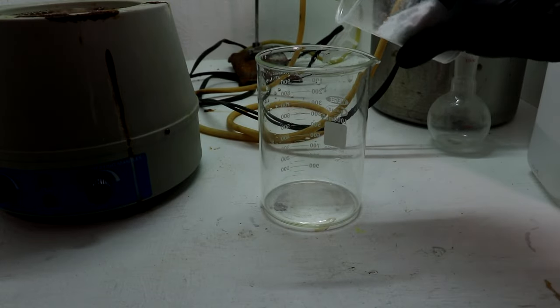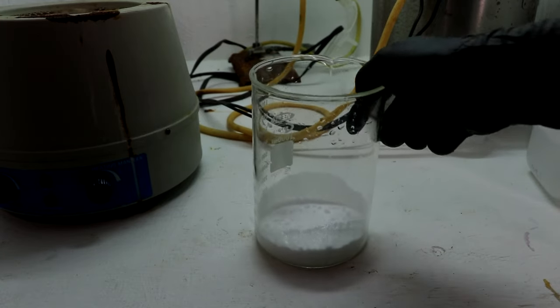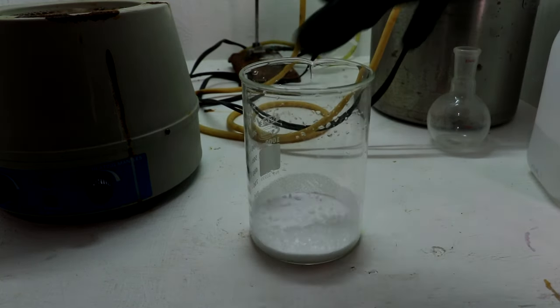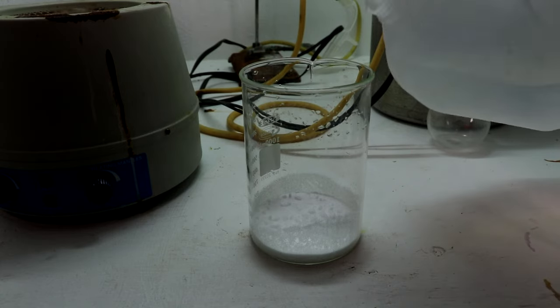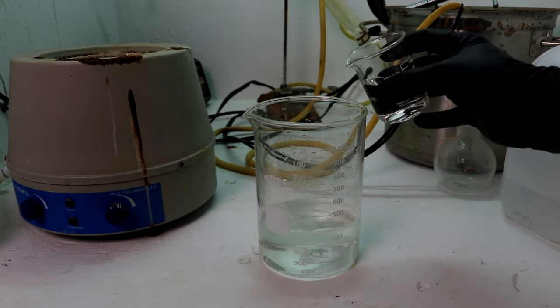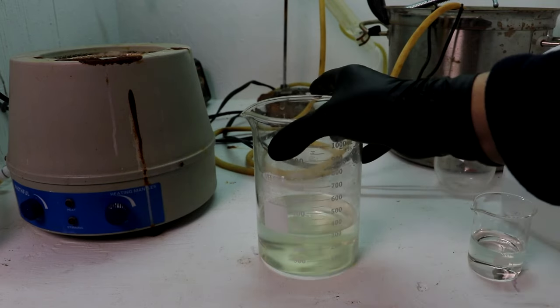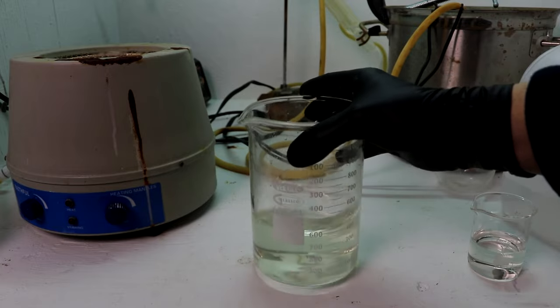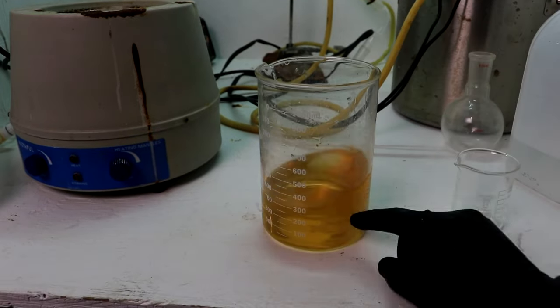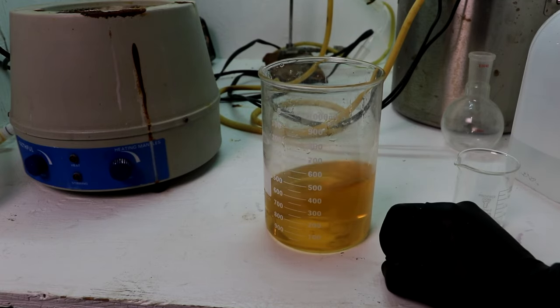I weighed out 205 grams, so this is 2 moles of sodium bromide. This won't make enough bromine to dissolve all of my gold, but it'll certainly dissolve this and probably the next batch as well. So, there's the sodium bromide. I'm going to add enough water to this to get it to dissolve. So now that the sodium bromide is mostly dissolved and I've got a better light going, let's add in 60 milliliters of sulfuric acid slowly so as not to heat up the solution too much. And this will form sodium sulfate, which some will precipitate, not all. Cooling it off will further precipitate the sodium sulfate and drive the reaction, forming hydrobromic acid in solution.